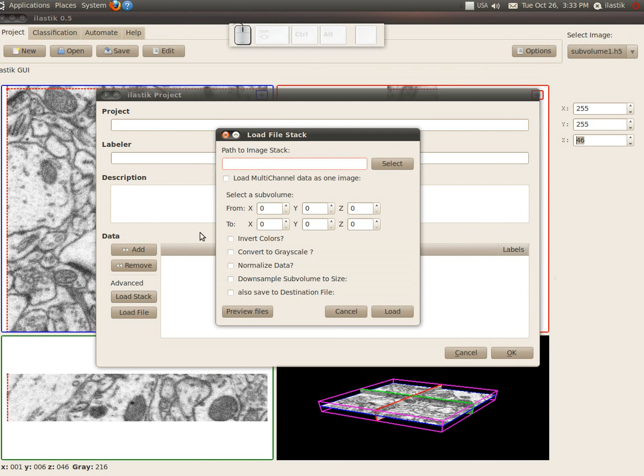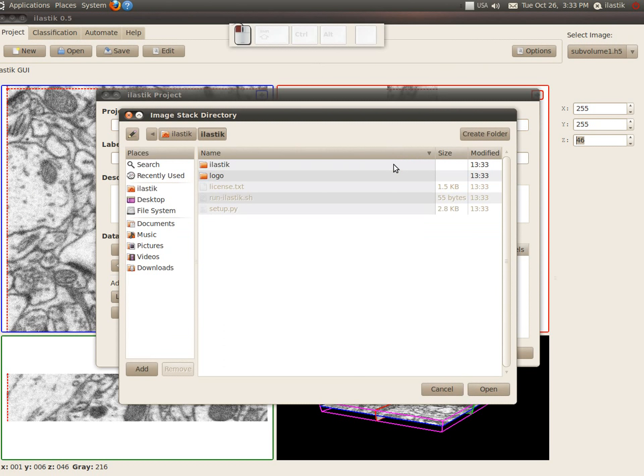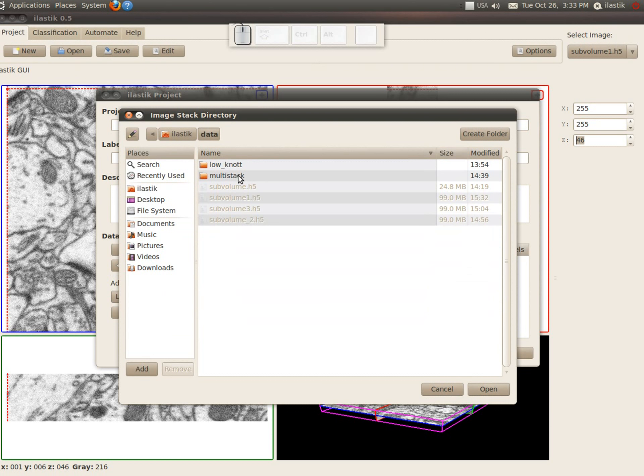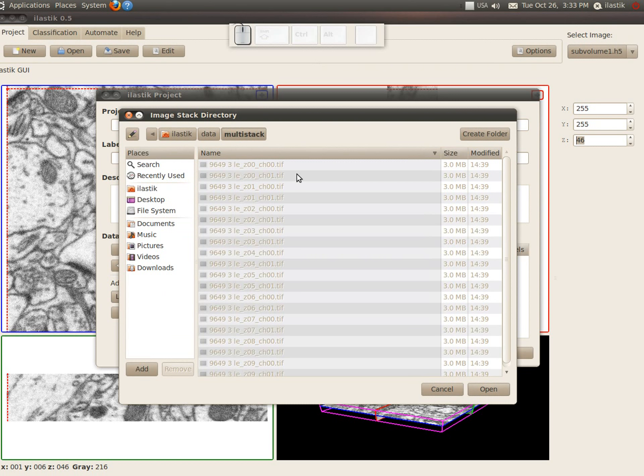So let's go to the load stack and now select a different data set, which was kindly provided by Anna-Martin Vilalba.